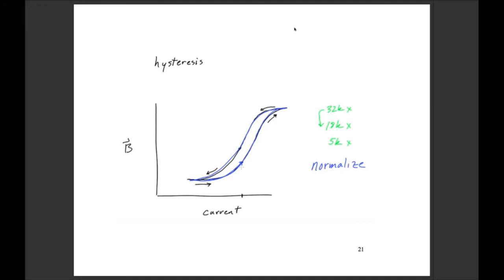So he mentions going from high mag at 32K versus 19K, and so you can do this thing called normalize your lenses. What that does is run a current: you have your original current that you're running your lenses at, and then it runs it above it, and then below it, and then back to the original. It creates some middle ground area, and that's what normalizing your lenses does. It's just to help minimize the hysteresis in your lenses.